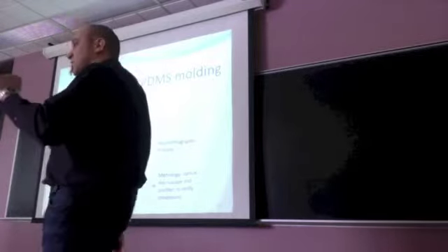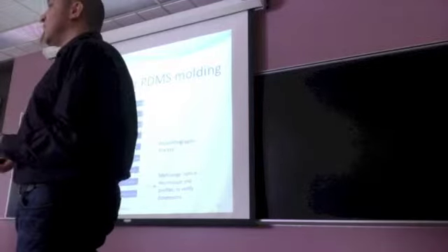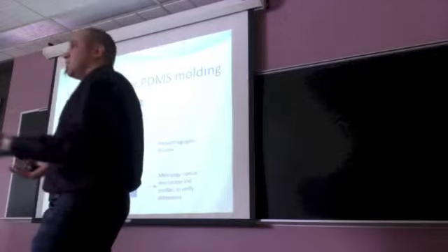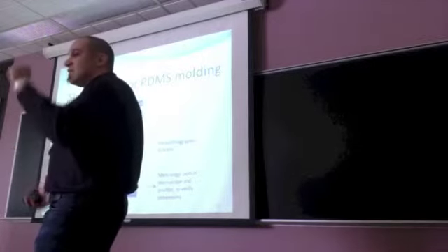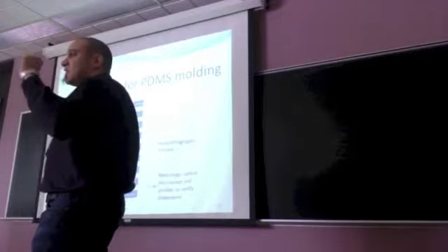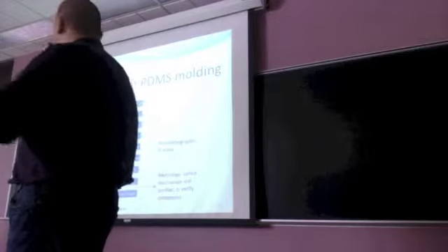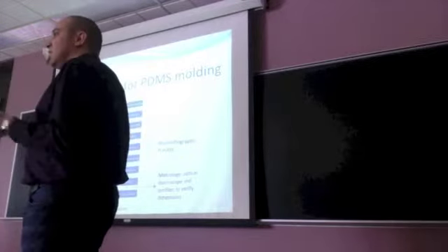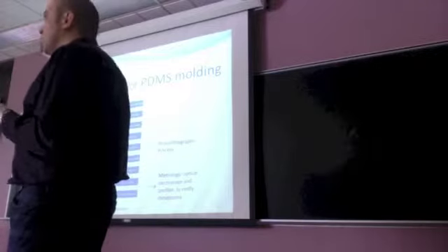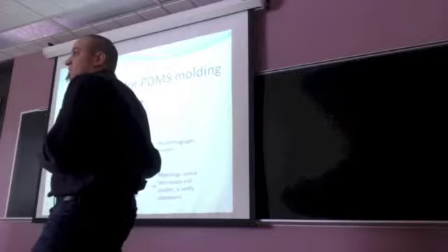It's a very slow process because silicon, like any semiconductor material, can have a native oxide layer due to moisture in the air. I think the maximum is 3 nanometers, but this 3 nanometers can affect a lot of things in the semiconductor industry, like adhesion of photoresist and also electrical properties. So when you remove it, you have to continue your process, don't wait.